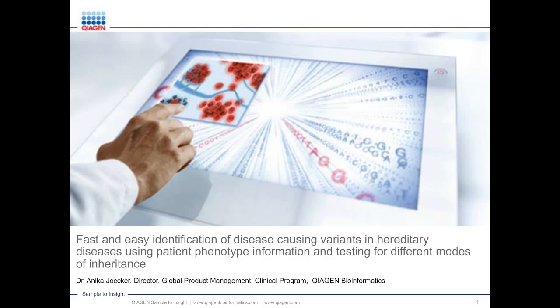Thank you very much, Christine, for the introduction. In the next about 45 minutes, I will guide you on how to analyze or how to find the causal mutation from a trio. So that means mother, father, and child.